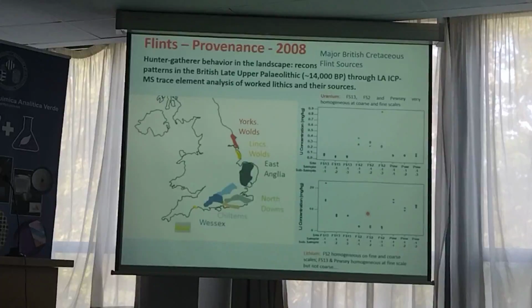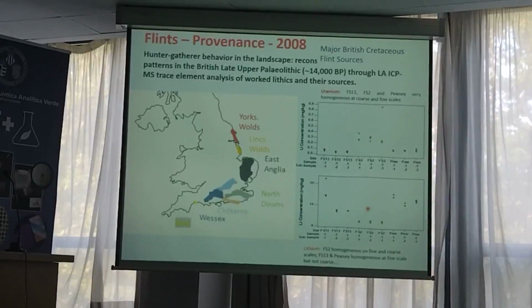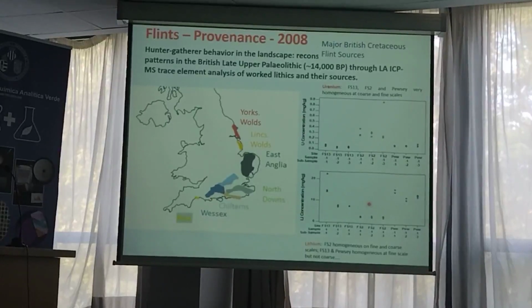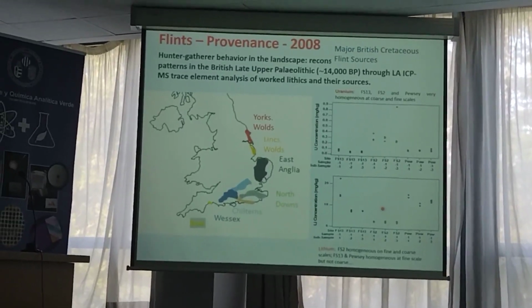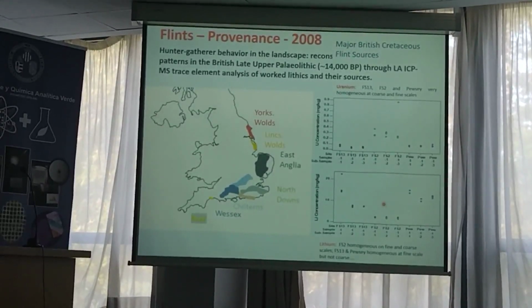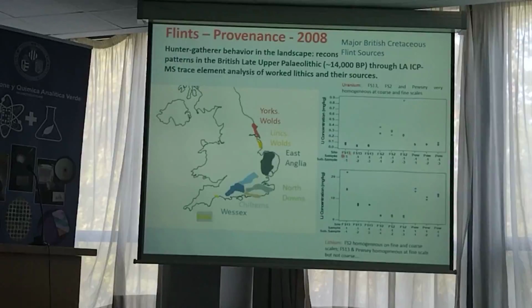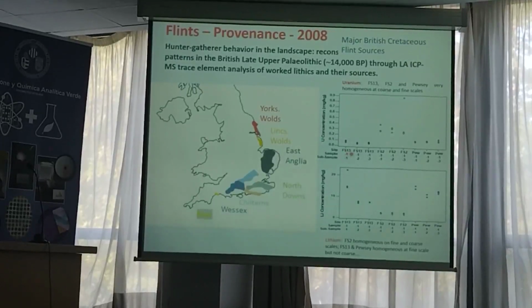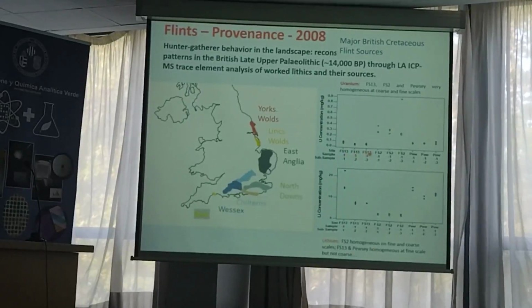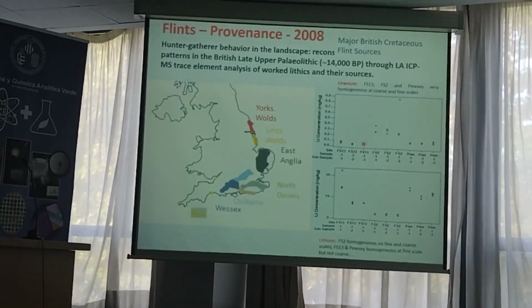A little bit of chemistry. One of the things that was important we wanted to know was if you sampled different places on the flint, did you get the same number? So what we did is a group of 3 ablations very close together, and then move maybe 5 millimeters or 10 millimeters away and do another group of 3, and then another group of 3. So here, for this FS13, this is the first space, then 5 millimeters, then another 5 millimeters away, and there are 3 analyses at each point.